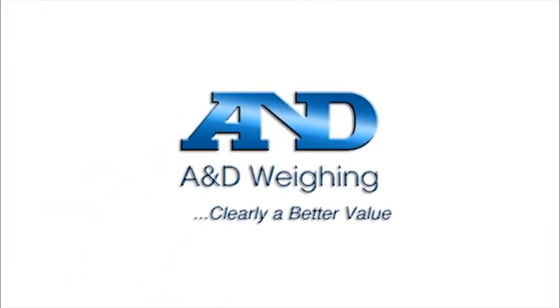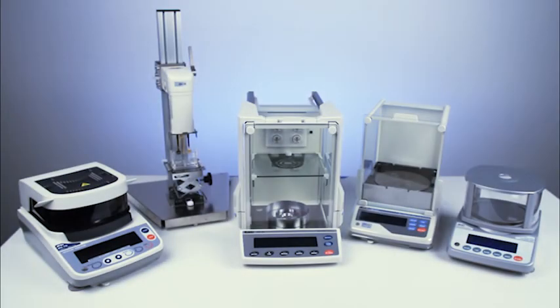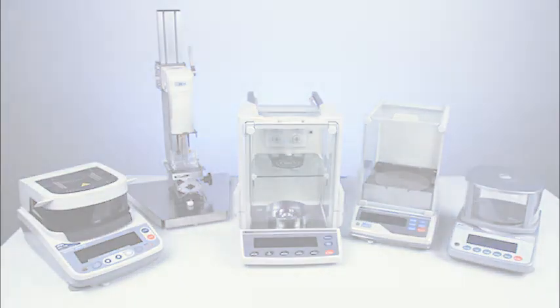The HRA series of compact analytical balances are available from the network of A&D dealers, who can help you select and maintain the right balance for your needs. Balances, microbalances, moisture analyzers, viscometers, and scales from A&D.